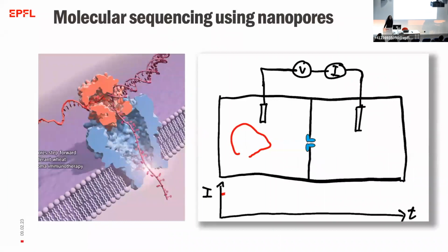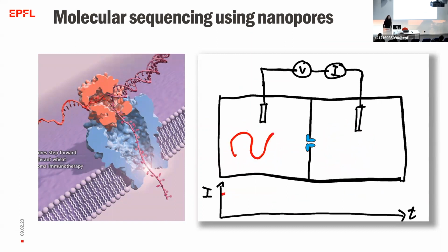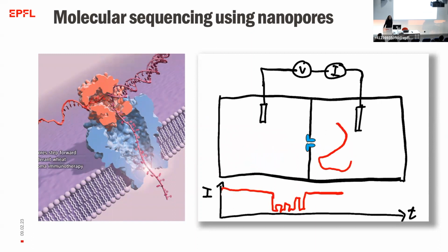Another technology that I also briefly mentioned are nanopores. In this nice animation, they are a method that allows us to read the information on a DNA.